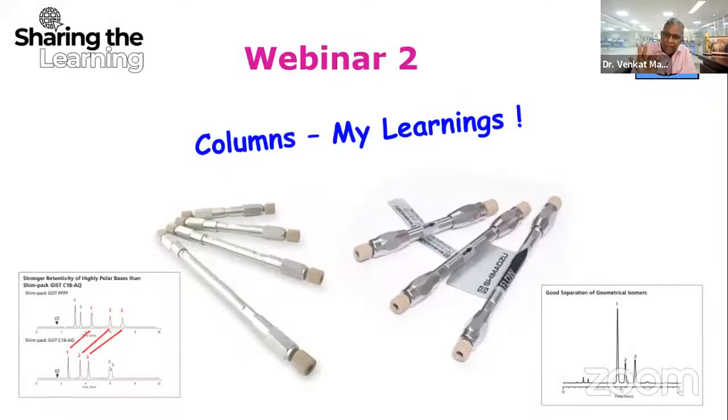Therefore, the basic fundamental rule to use a chromatographic system is you should be able to dissolve your sample, which is the most important thing. If I dissolve the sample, I resolve all the components.